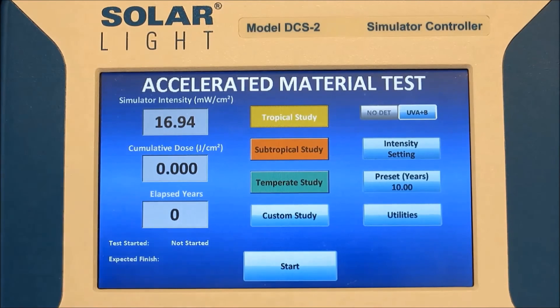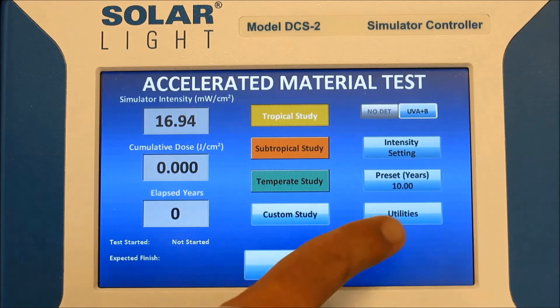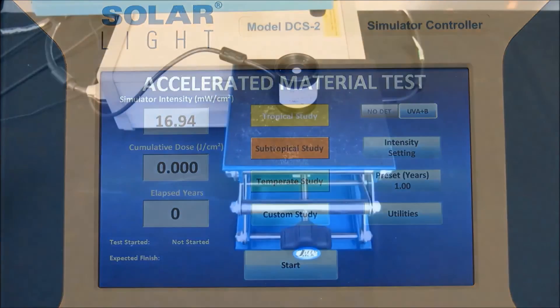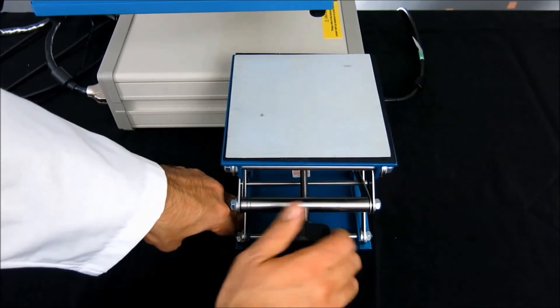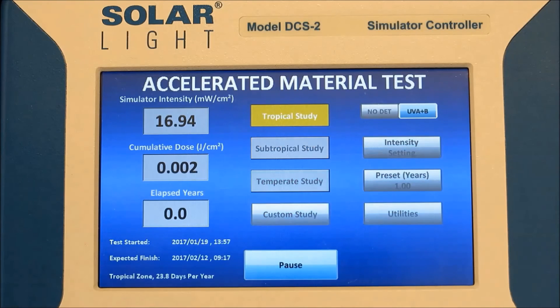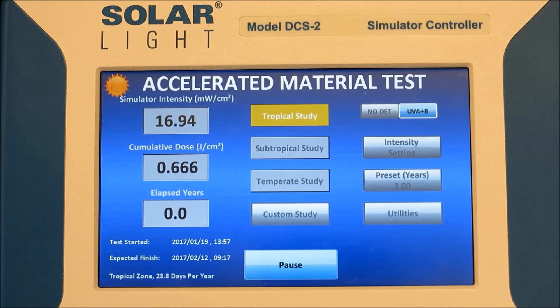The next step is to select the region which we want to simulate. We can pick from tropical, subtropical, temperate, or custom. I can preset the value in years, months, or days to get the exact dose I need. At this point we're ready to start the real test — we remove the sensor and insert our sample. We adjust the lab jack so that the height of the sample is the same as the height of the sensor, which is usually approximately 180 millimeters, and then we hit start on the DCS-2. The shutter opens, and the DCS-2 displays the exact time of test start, expected finish, and cumulative dose. You can always pause the test to study color or texture change, and resume whenever you want to. The DCS-2 keeps track of everything from beginning to end.